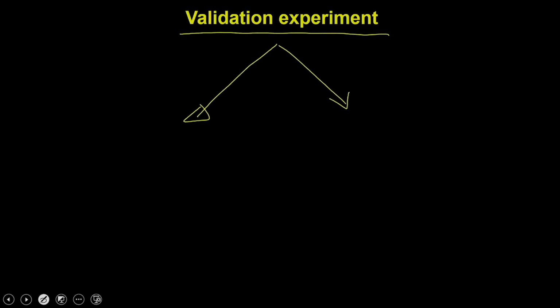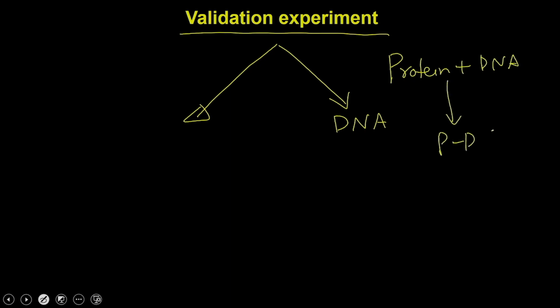One, where you can remove the DNA, because the protein plus DNA gives you the protein-DNA complex. If I remove the DNA, I should not get the PD complex.